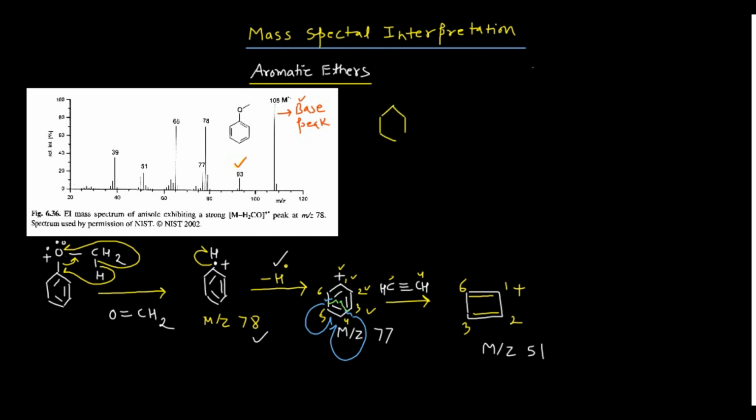This is my benzene system, okay? This is double bond oxygen, and then 2 of the lone pairs are over there, and positive charge is here. There is no problem in that. This is the structure which I have produced. What I have done here, I have actually shifted the electron pair over there. This will get the positive. 2 lone pairs were already there. Now for the sake of understanding, I can number it again: 1, 2, 3, 4, 5 and 6. So this is how I can number it.